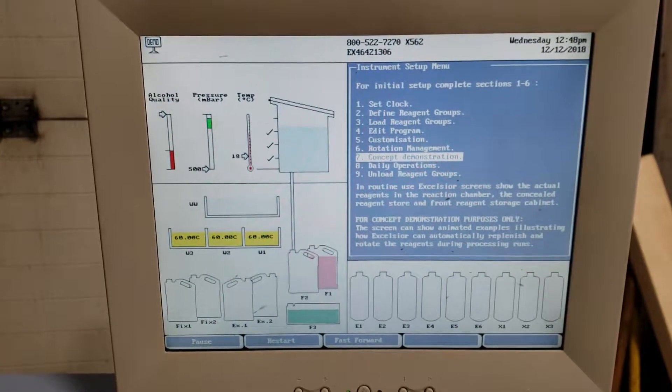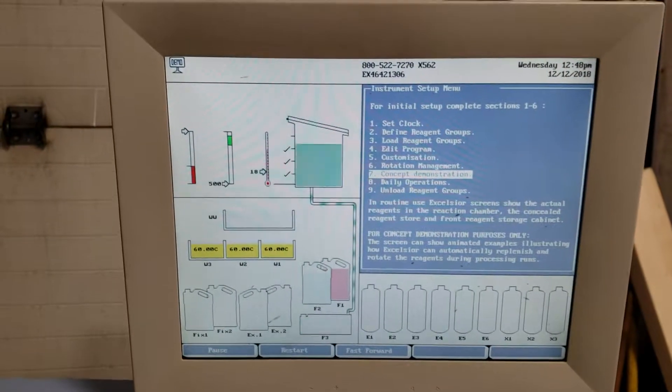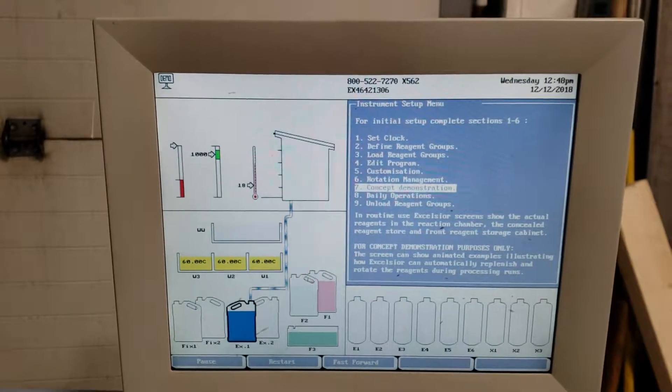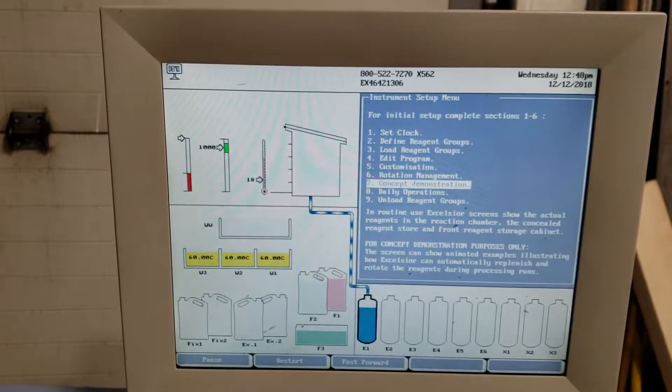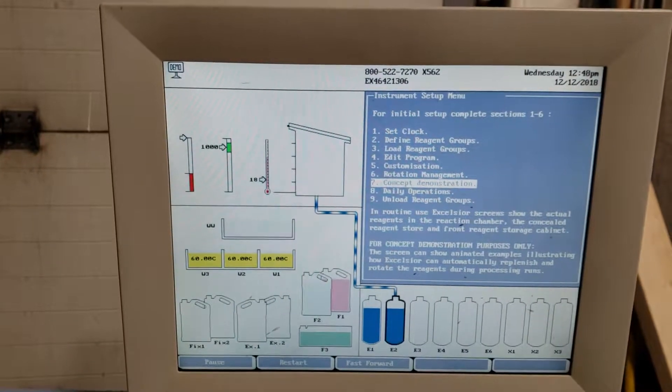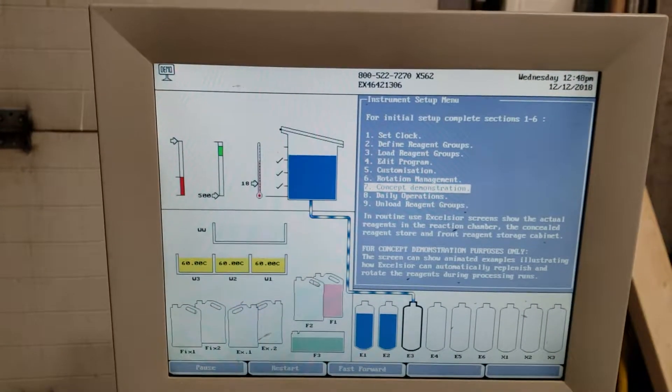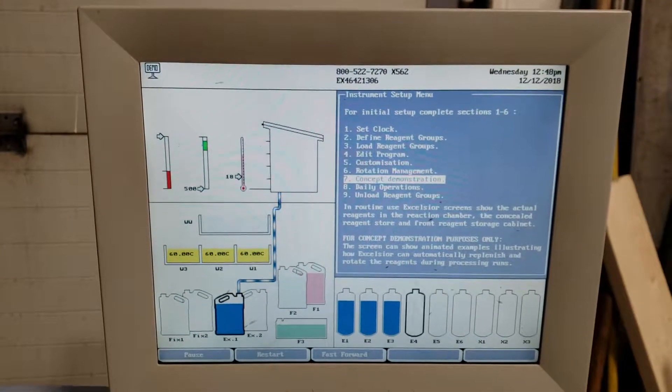It'll run through this. I put it on fast forward. E1, E1, E2 - that's the reagent filling up the tissue chambers. It's just a concept of operation.